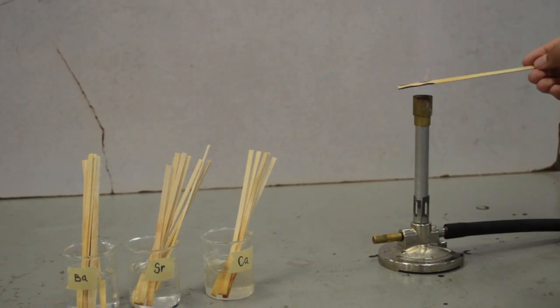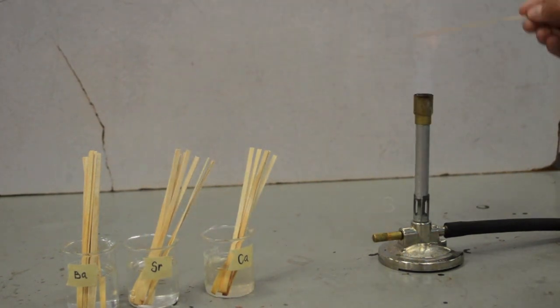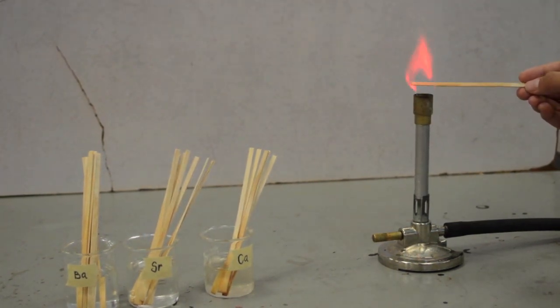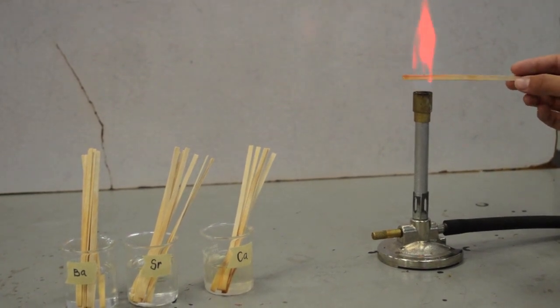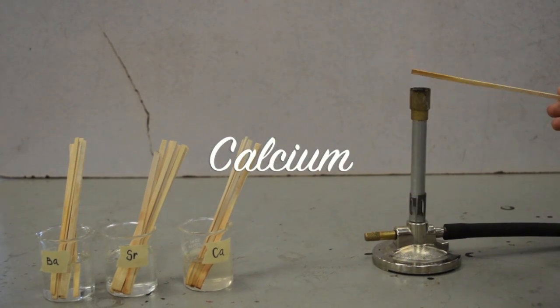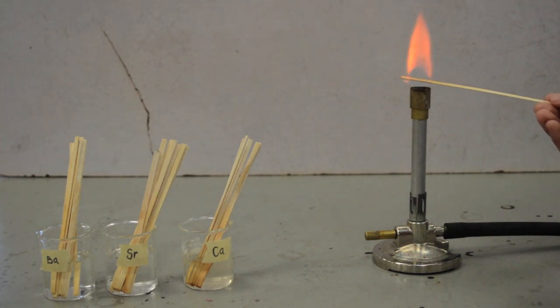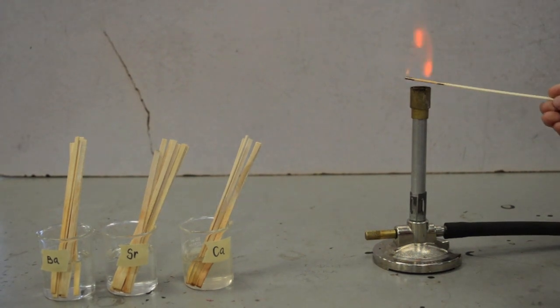Wavelengths in the visible light portion are within 400 to 800 nanometers. The red color that the strontium emits has a wavelength between 620 and 780 nanometers. The next metal that we will perform the flame test on is calcium. Calcium emits an orange-colored flame. The orange color produced has a wavelength of 585 to 620 nanometers.